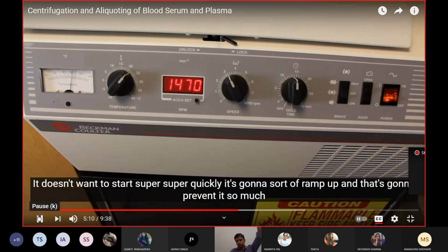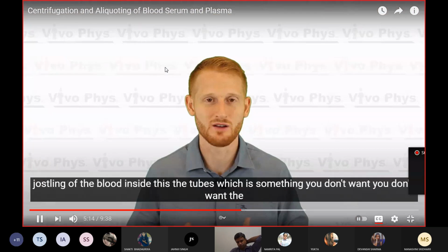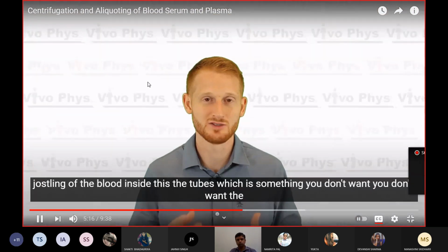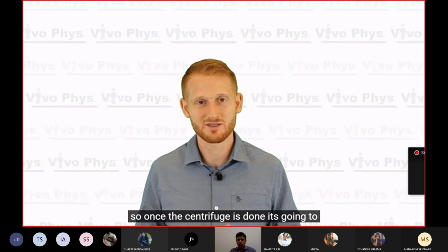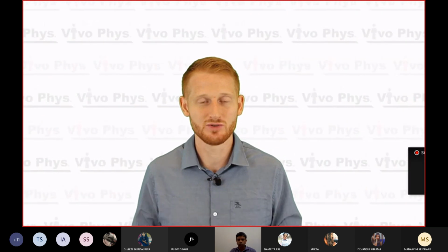It's going to sort of ramp up slowly to now reach up to 3000 RPM. This is going to prevent jostling of the blood inside the tubes, which is something you don't want. You don't want the tubes being sort of jostled around, because it's going to increase the likelihood of damaging the sample. All right, so once the centrifuge is done, it's going to start to brake itself.